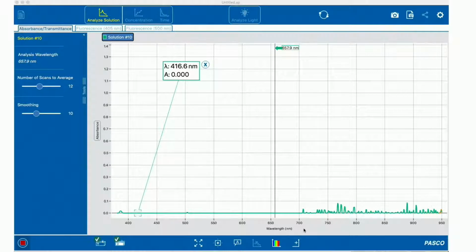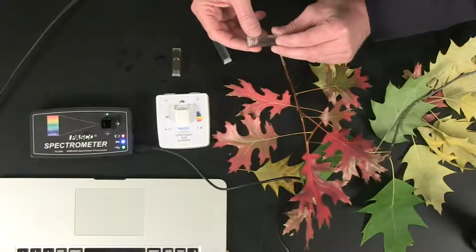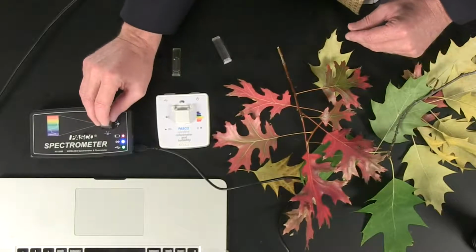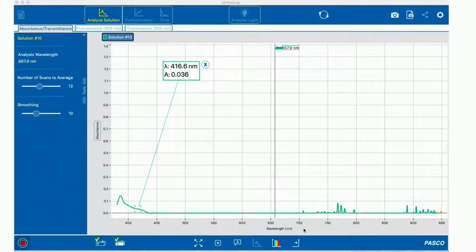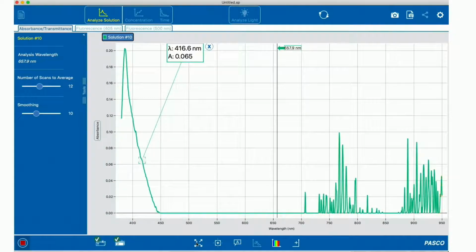And what I'm going to do, I'm going to take that vegetable oil and put it into my sample, and let's see what happens. Here we go. Collecting some data. Let me expand this out for you. What do you see? Looks like we're getting not a whole lot of action right there. And no action here, right? Nope. We don't see the two peaks. The two spots I expected to see the peaks are missing.